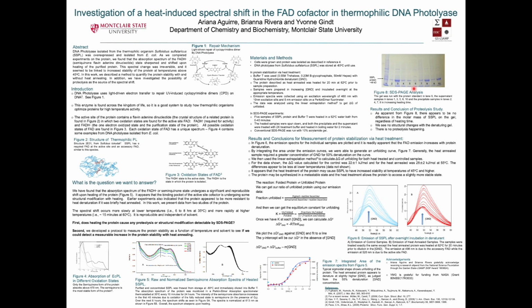We heated identical samples at 5 different amounts of time. The first sample in lane 1, right here, was the supernatant and was not heated. The second and third samples were the supernatant and the precipitate, respectively, and were heated for 10 minutes. Each successive sample is the supernatant and precipitated protein after 20, 30, and 40 minutes.